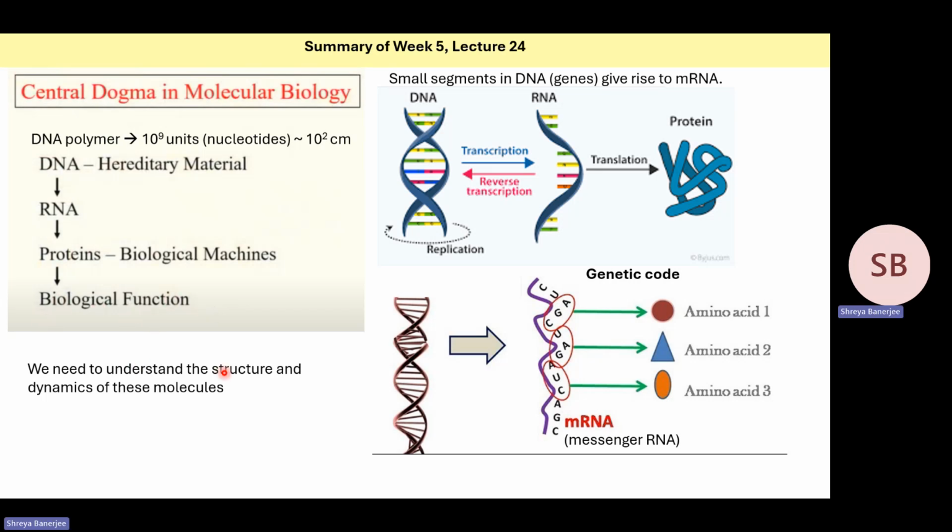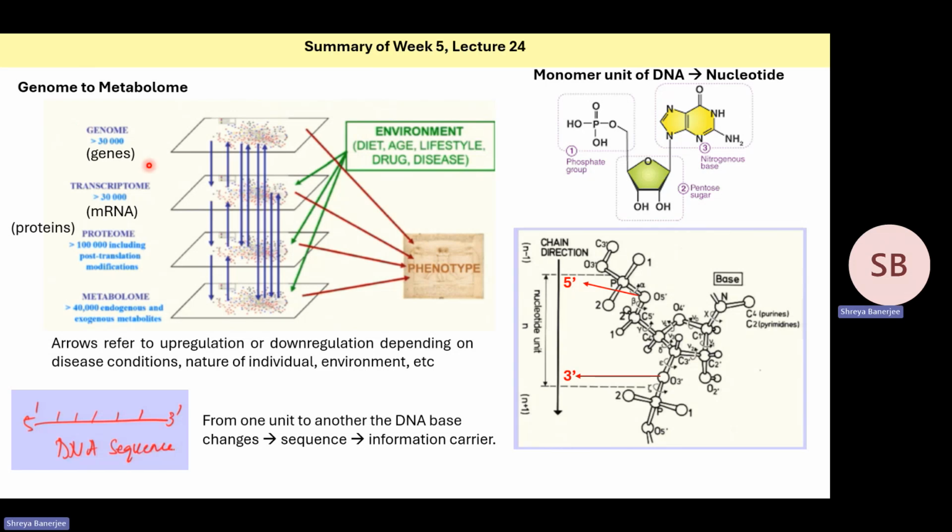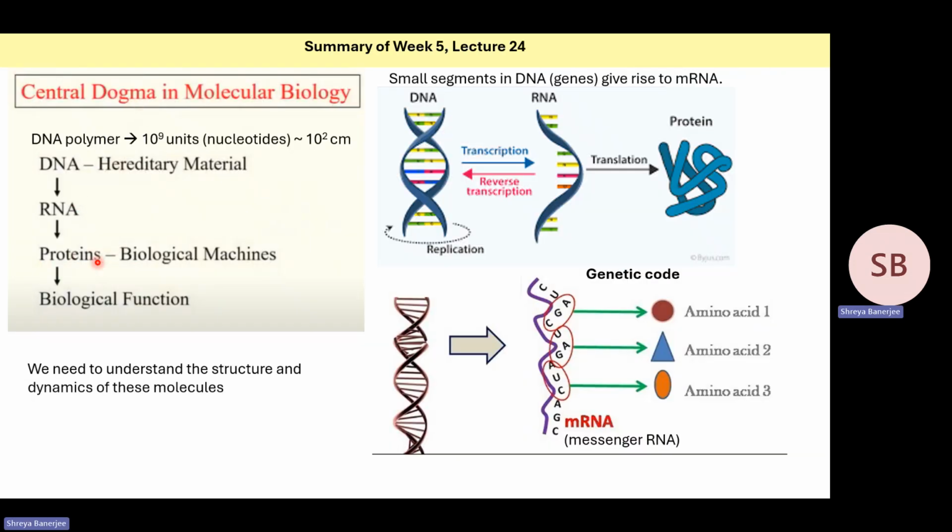So basically, we need to understand the structure and dynamics of all these biological molecules, and we will do that using NMR. But before that, as I said, we need to understand what these biological molecules are and what conformations they can adopt. Now, as you go from DNA to RNA to proteins, the number of molecules increases.